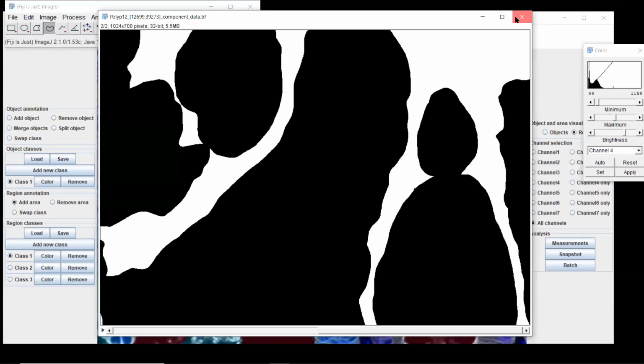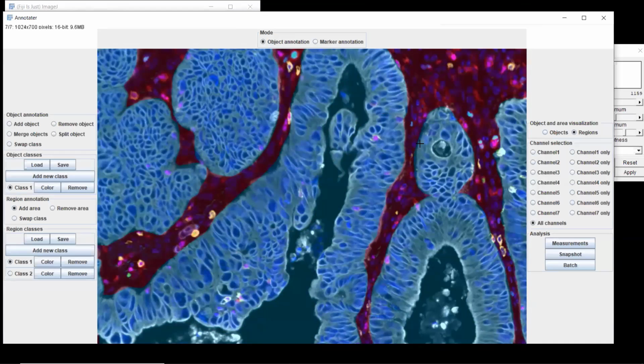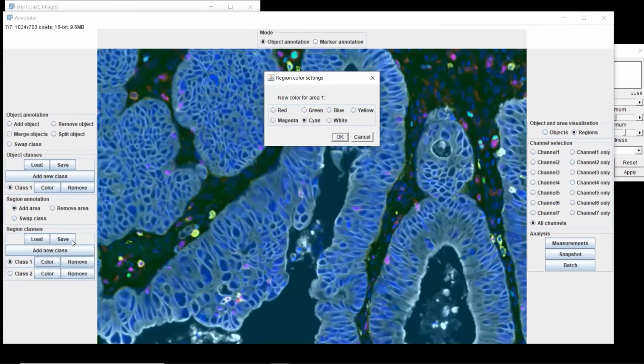And so if I load it here, this is what I get. Here you see, I can change, maybe this is not great. Let's put it in green, for example. So, no, that's not this one.